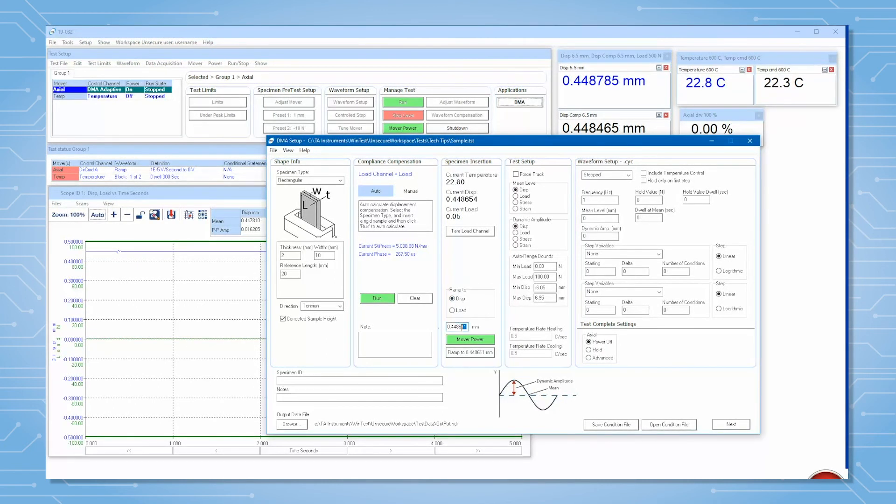If you want to start your test at a certain displacement, you can use RAM 2 button to move the grip to a certain displacement before tightening the top screws. Now you are ready to set up your test conditions and run your DMA test.